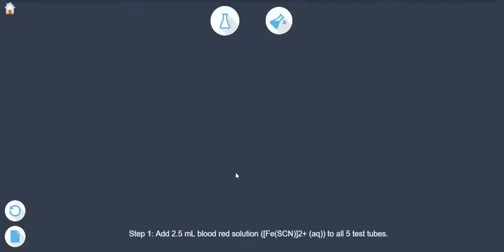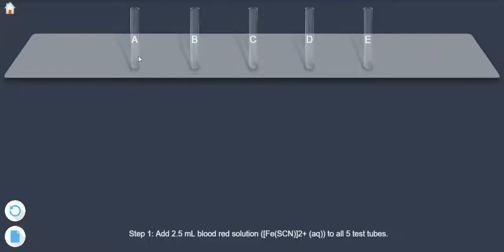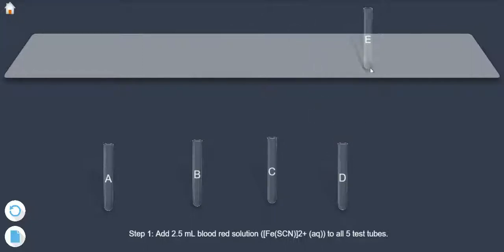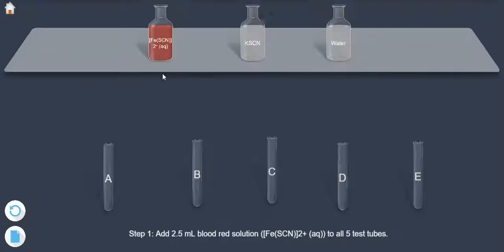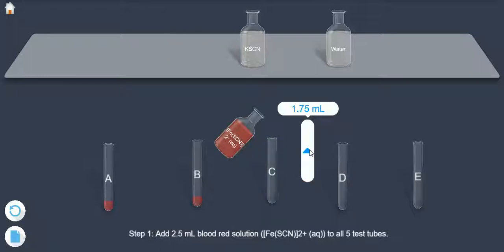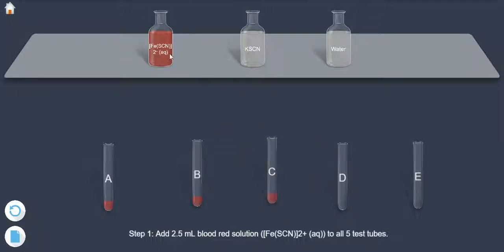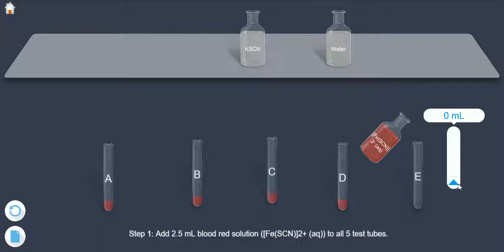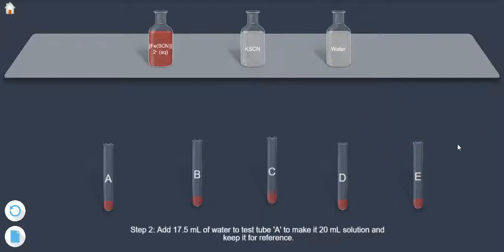Step 1. Add 2.5 ml blood red solution to all 5 test tubes. Step 2. Add 17.5 ml of water to test tube A to make it 20 ml.